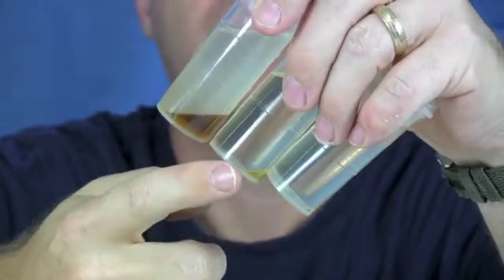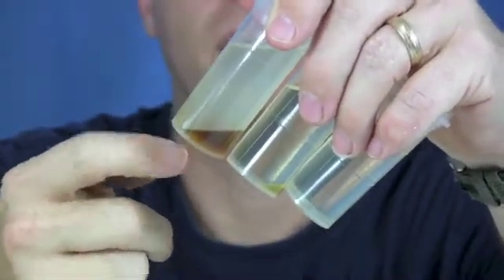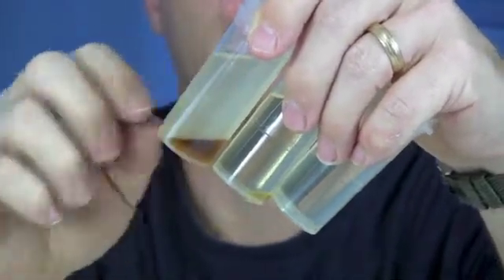Notice there's no fallout here. This test has some fallout in the corner and this is just plain simple oil in this batch — notice how cloudy it is as well.